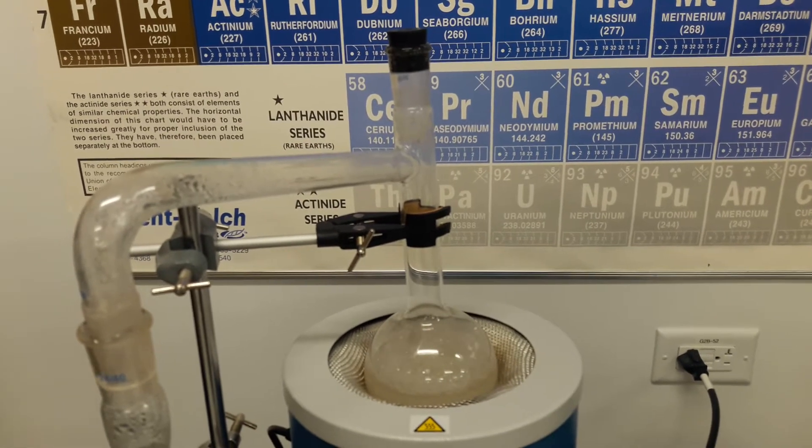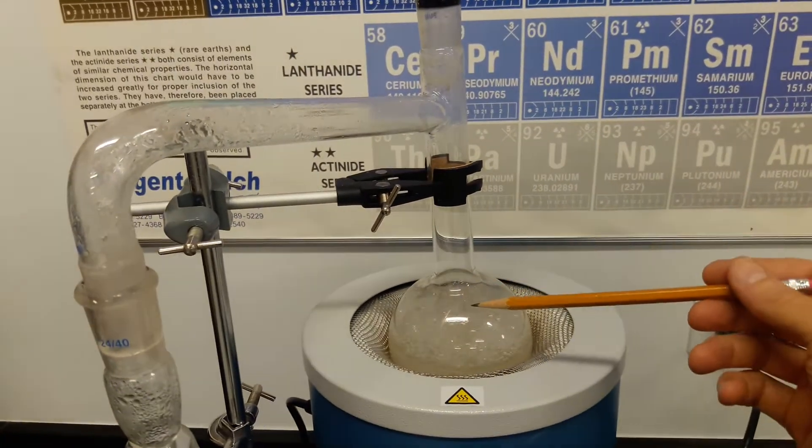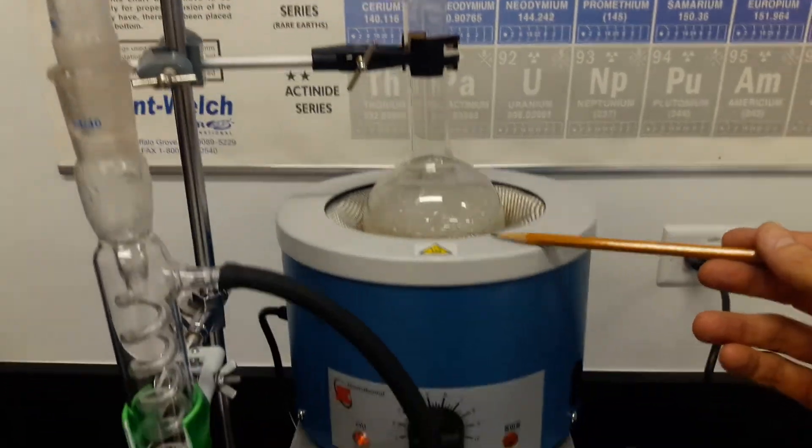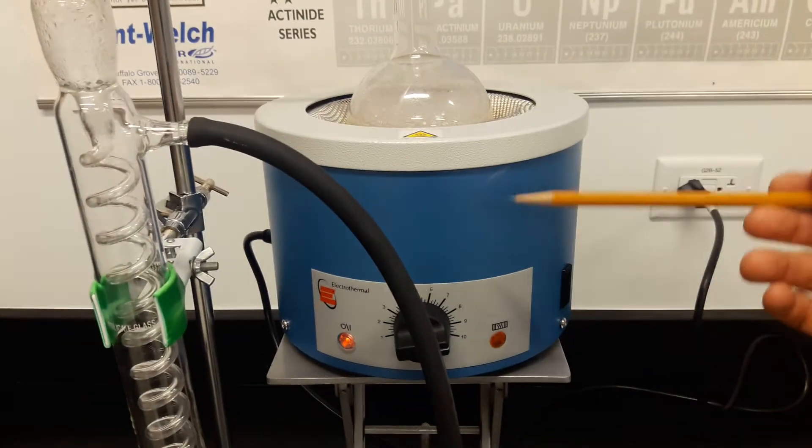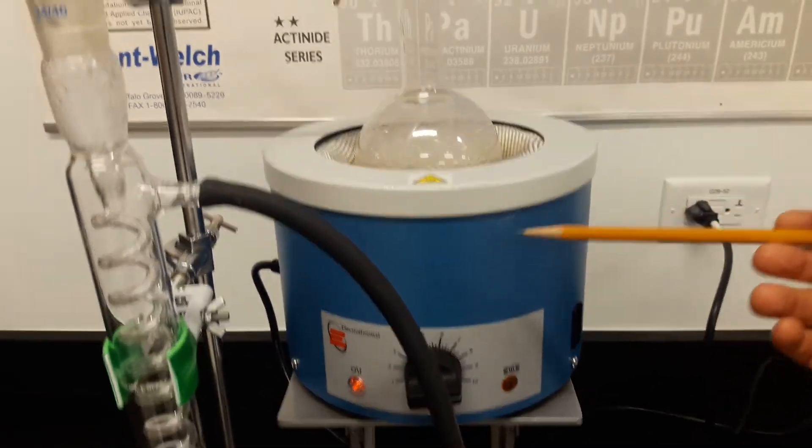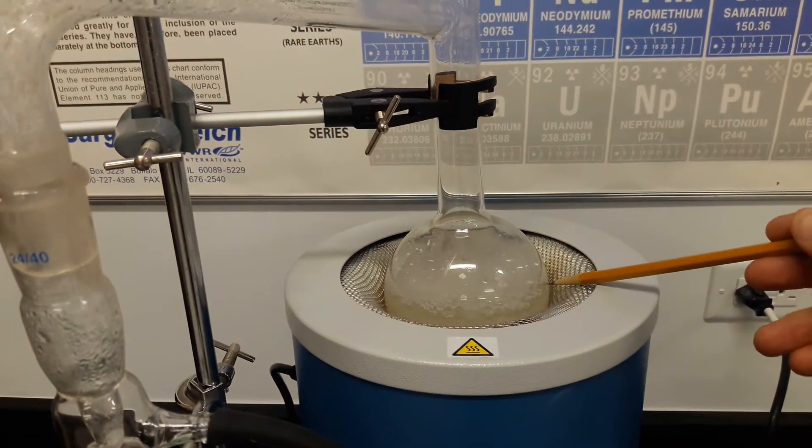The sugar wash is placed into this round borosilicate flask and that flask is then placed into a heating mantle. Rather than using a Bunsen burner, we use a heating mantle. It's simply a device that heats up the fluid in this flask.